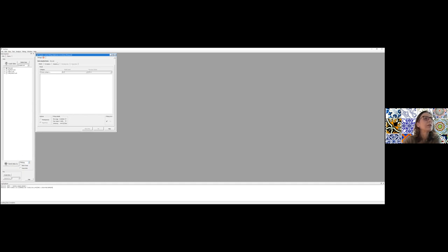Okay, and you can see that this fit panel now becomes active. And it says data loaded from lysozyme sub. So you know that this is the data that you're fitting. And you can see that you have different tabs: model, fit options, and resolution. Here is where you decide which model you're going to use.